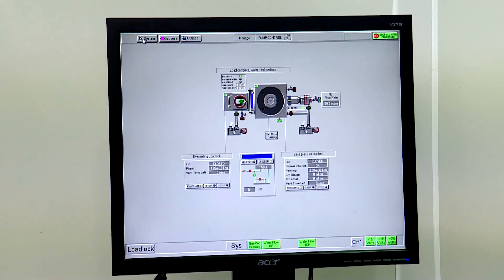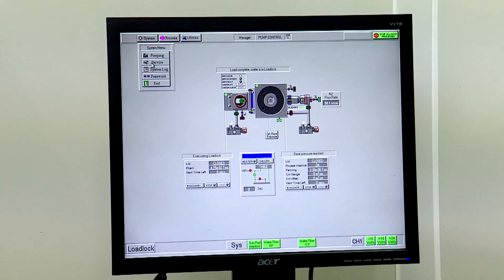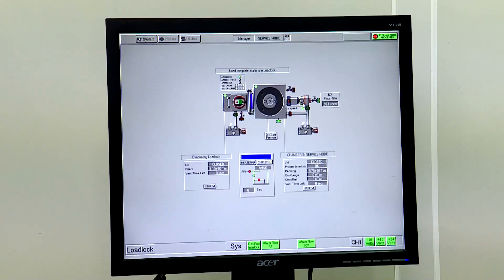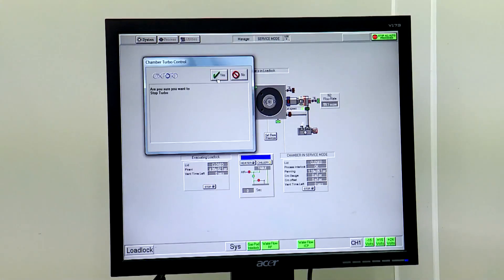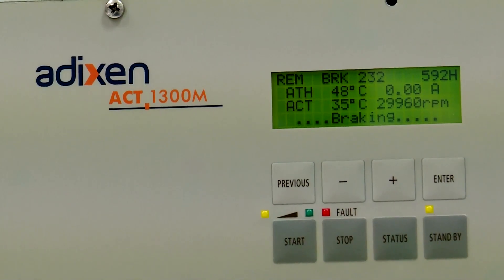Go to the PC2000 in service mode and switch off APC valve. Next, reduce the turbo speed slowly to 0 RPM, then switch it off.